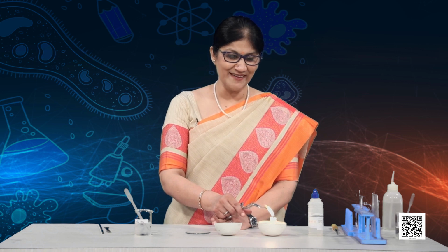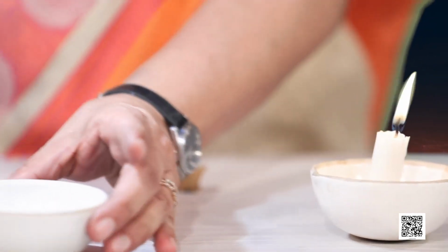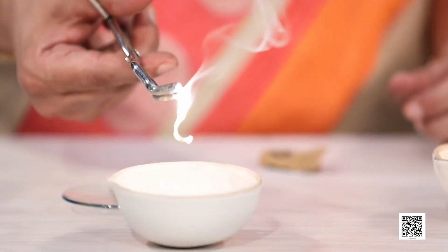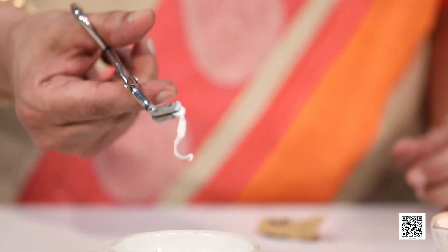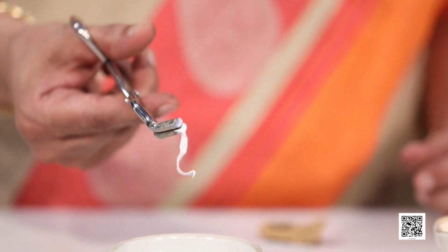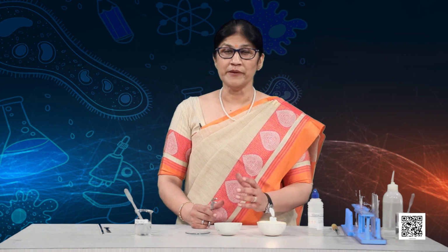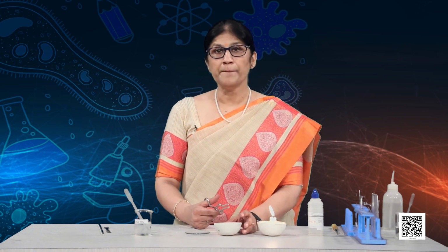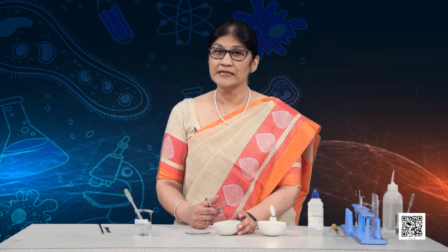So, now you see what a beautiful white dazzling flame. My dear friends, when you are performing this experiment, remember not to look directly into the flame of magnesium, because the flame is so dazzling white that it may harm your eyes. Now, you see, after burning we have got magnesium oxide, the ash.